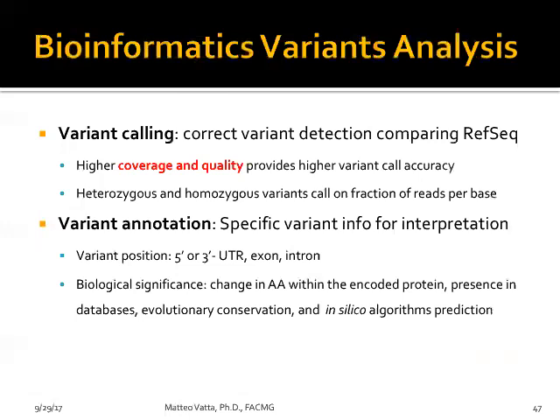Minimum. So you prefer to have more coverage, even though the base quality is a little bit lower? No, I prefer to have a higher quality per base, even if the coverage is a little bit lower. Let's say a 50x coverage with high quality will give much higher confidence than a 2000x coverage with extremely bad quality data points.